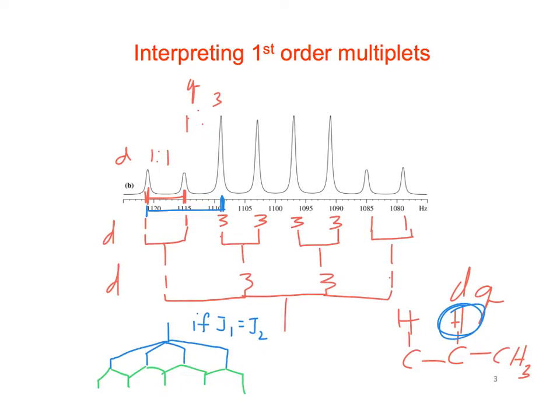But you can see even on this spectrum, some of these peaks are more round or not as sharp. And so in those cases, it's harder for the computer to pick the tip, right? We get these coupling constants by measuring the difference between these 2 points in hertz. And so they won't be the same out to a whole bunch of decimal places. So what you typically have to do is take the average, and that's what you would report.